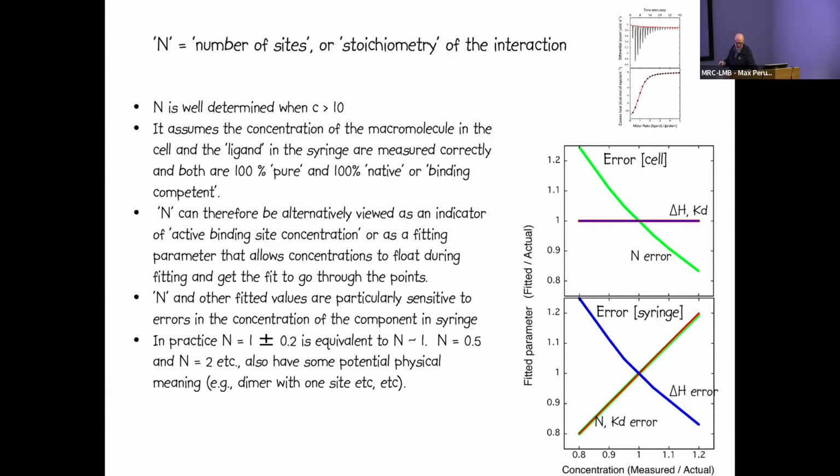And for that reason, stoichiometry becomes a fairly well constrained parameter during the fitting. So you can do any other type of optical assay, titration, or binding experiment, and if you work under conditions where you're in excess of KD, if you think about the C value, when we have a C value of 10, we're 10 times above the KD with the components we're measuring.